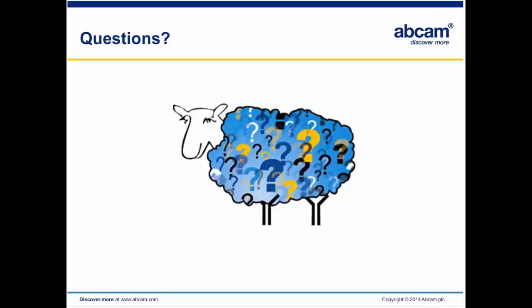And the third question is: is there a simple way to quantify changes in peak height between two ChIP-seq experiments using the same antibody, using chromatin from different cell types or conditions? Well, this is a very tricky and very good question.